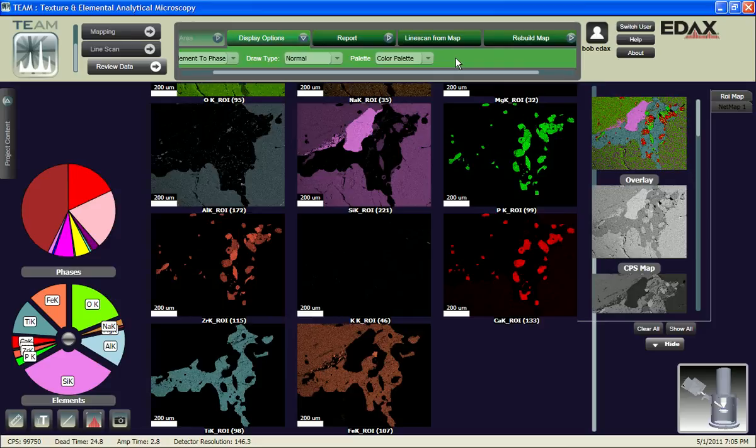Also, you'll see that the ZAF weight percent map and the ZAF atomic percent map will look very similar to the net intensity map. Maps and images are, by their nature, somewhat qualitative, not so much quantitative. So you'll get almost all the good information you want from the net intensity maps. You almost don't need to do the weight percent or the atomic percent maps.